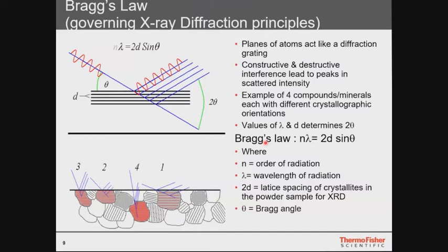Atoms, if they are periodically ordered, will form something called lattice planes. So there are planes and they repeat in all dimensions. The distance between these planes forms something like a grating. At this grating, we can do diffraction, and the position of the signals we get from our diffraction experiment is given by the equation you can see here. That's the most fundamental equation of X-ray diffraction.